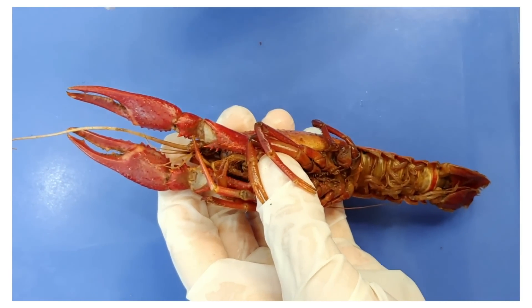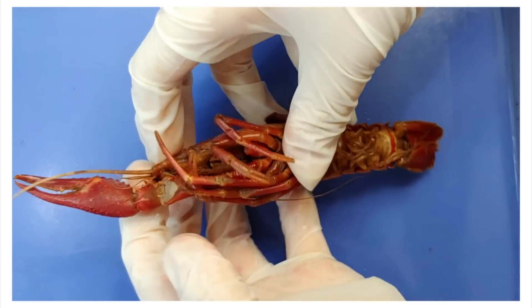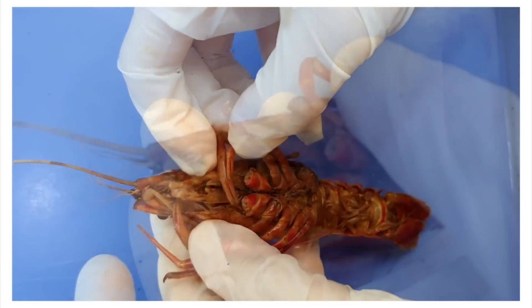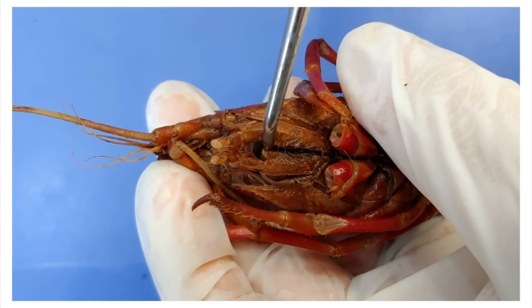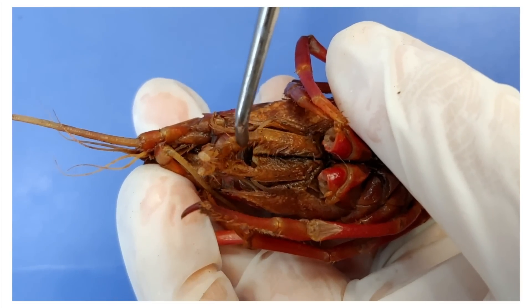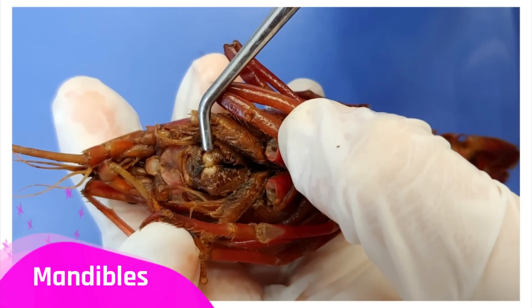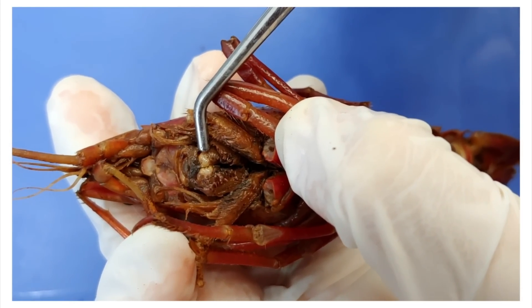Now I'm going to snap off the pincers so we can take a better look at the mouth. These are called the maxillipeds, and they hold and push food to the mouth. It's kind of like if you had a pair of legs right next to your mouth, because why not? Now underneath these, these are called the mandibles, and they're used to grind up food. They also move side to side.